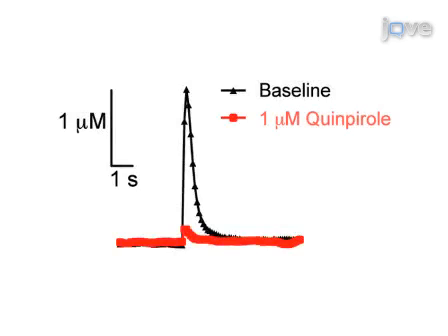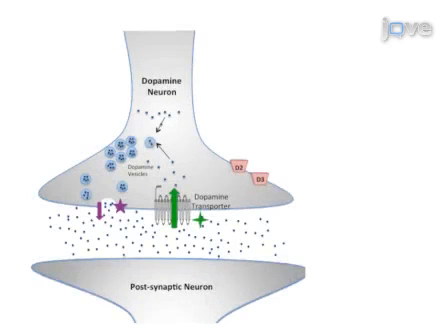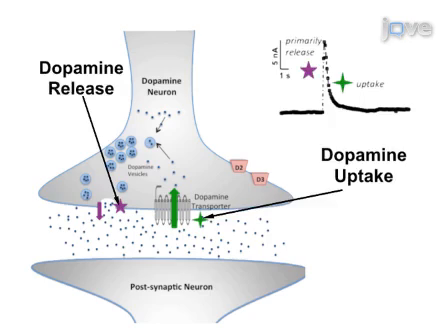Finally, a pharmacological agent of interest is applied to the brain slice, and its effect on presynaptic dopamine dynamics is observed. Ultimately, this protocol shows changes in presynaptic dopamine dynamics, such as stimulated dopamine release and dopamine uptake rates, through fast-scan cyclic voltammetry.